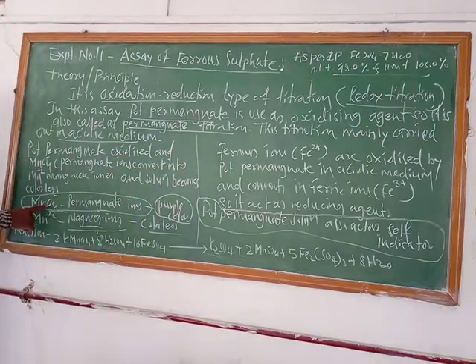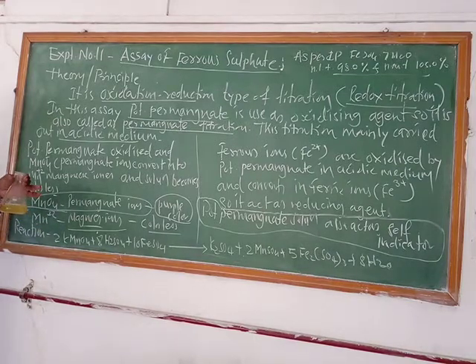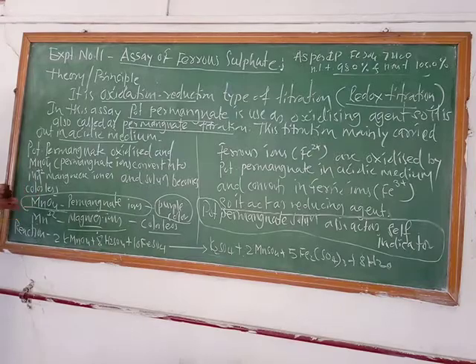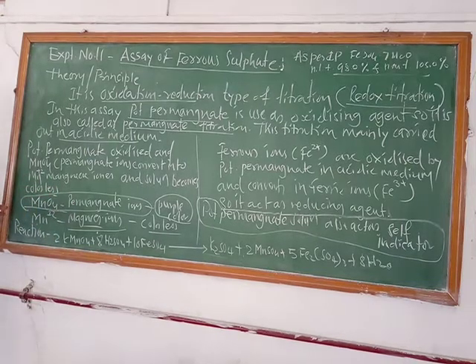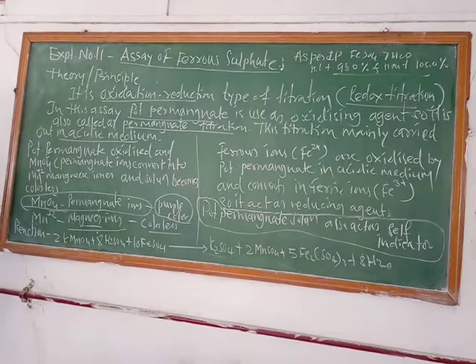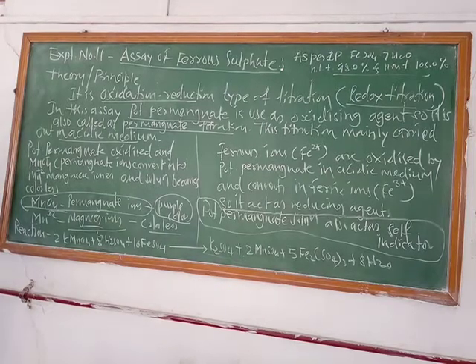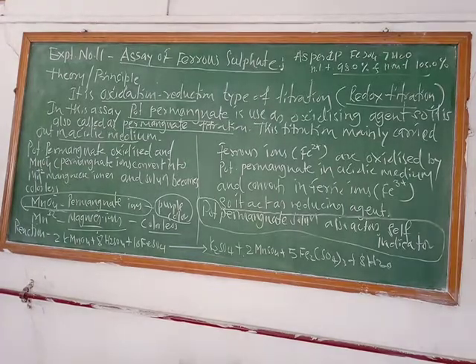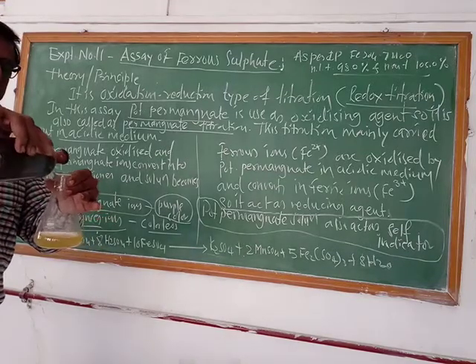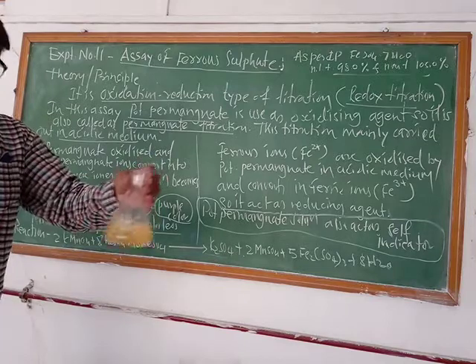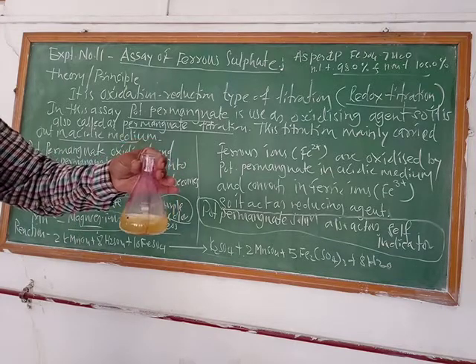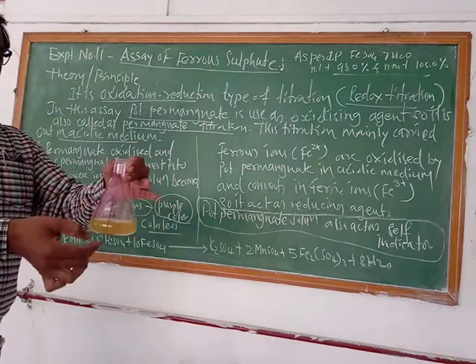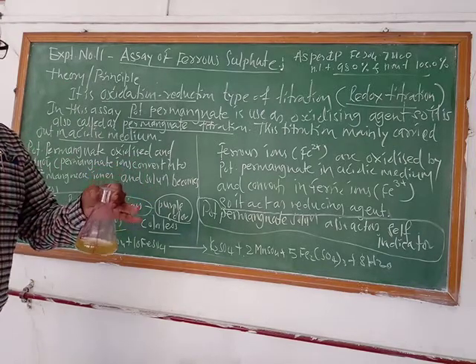Because those permanganate ions, when the reaction is completed, there is no reducing agent, so just one drop of potassium permanganate solution produces color. Then it becomes colored. See the disappearance of color when you add potassium permanganate solution again — it becomes colored.